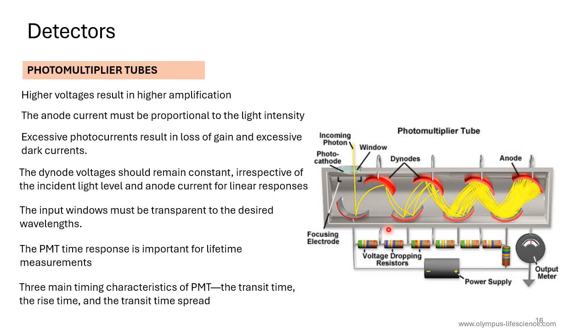So it will take a different time to reach this anode. And as the photoelectrons do not have any restricted path, they can actually go in different paths. So there is an overall transit time spread that occurs in this case, and this is a limitation of the photomultiplier tube.